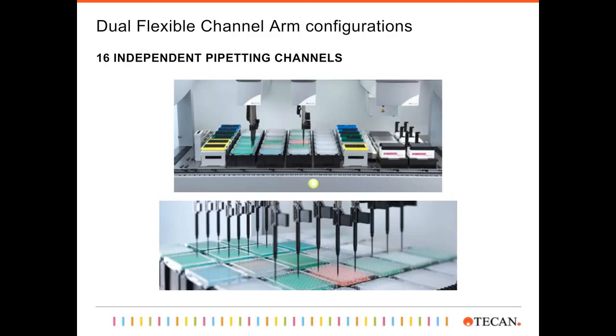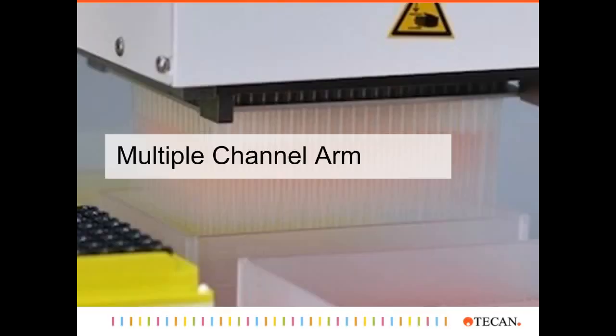The next arm, the multiple channel arm. This one has a nice little video to show you. This is the flexible adapter exchange. This arm has 384 channels in the head, but what the video will show you is how quickly we can switch between 384 tips and 96 tips. Let's go ahead and start this video.